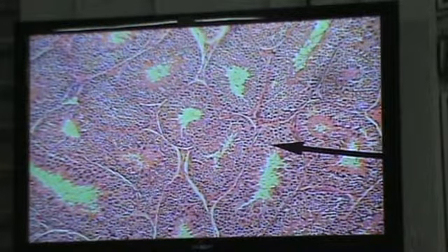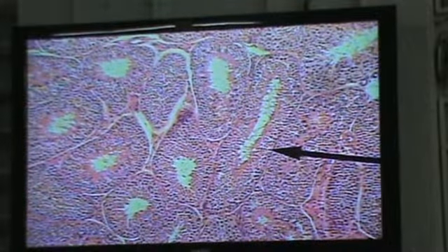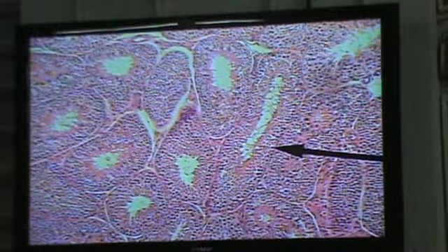Okay? Alright, so you'll see from that black and white diagram that there's what's called the mediastinum testis. So you have to go a little slow with them. Alright?